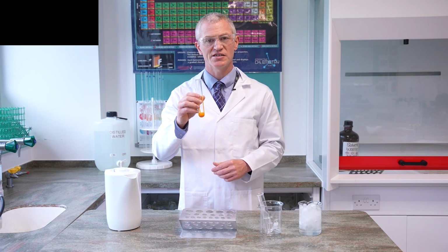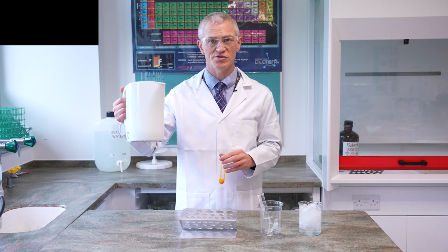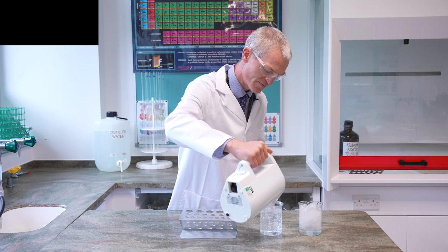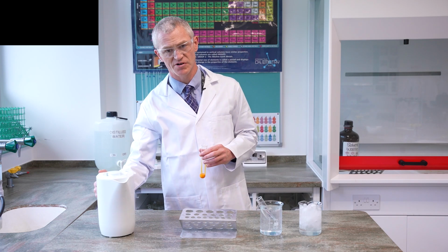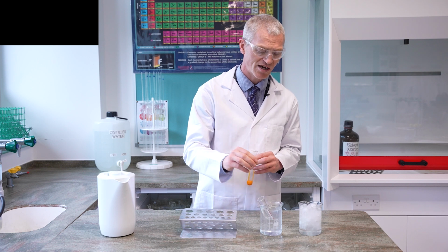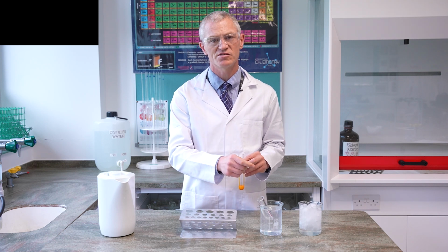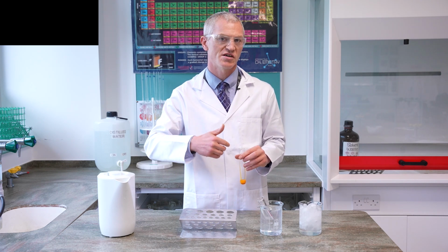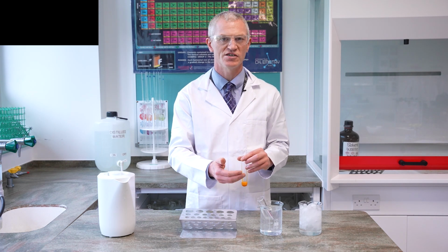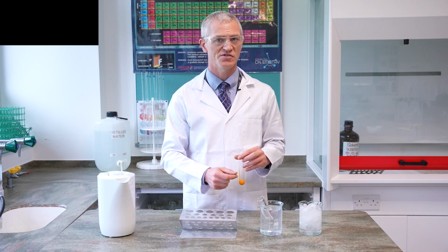And we're going to take this precipitate and we are going to dissolve it in a minimum amount of hot solvent. So we have a recently boiled kettle right here, and we have our solvent in the boiling tube in here. You've got to make sure that it's very, very hot, so make sure that is a recently boiled kettle, okay, and make sure that you have enough solvent to do the recrystallization. Now normally you would add a minimum amount of hot solvent to make sure that your product crystallizes out at the end. So that minimum amount of hot solvent is really, really important. But for this video, we've measured out the exact amount of solvent that we need.